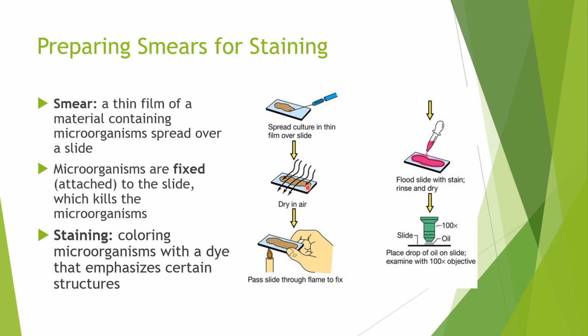Then it's pretty important that you leave it to dry, because a lot of times we're getting those specimens from fluids, etc. It's pretty important that you let them air dry.